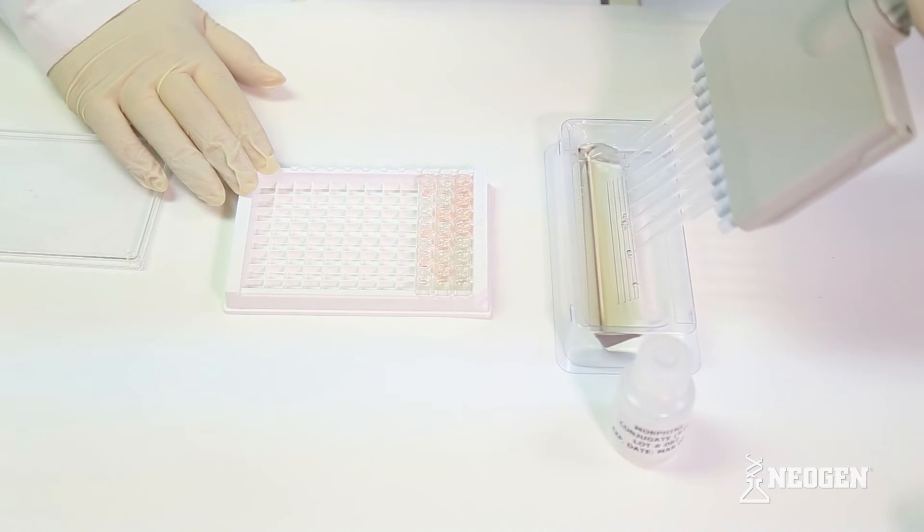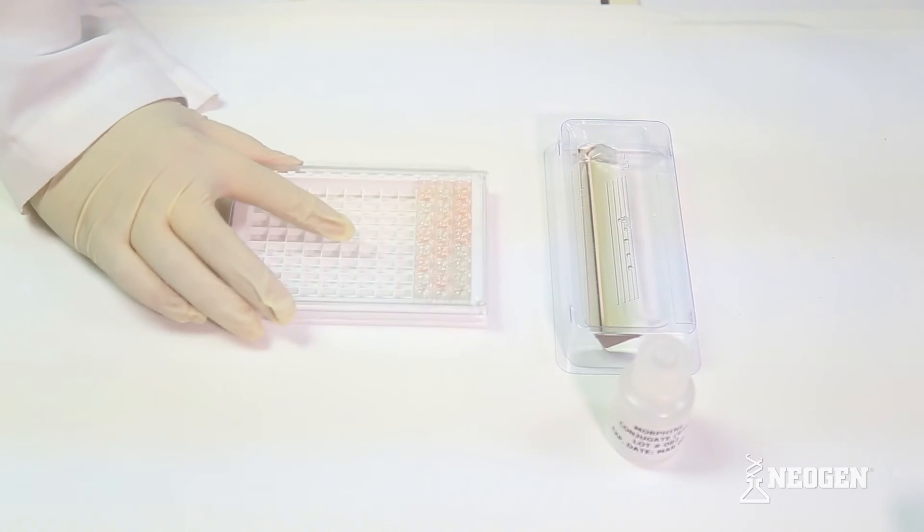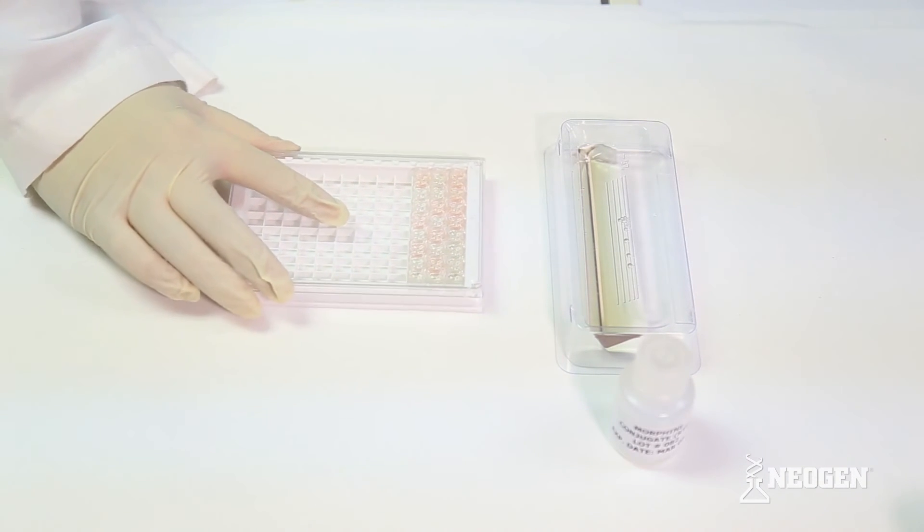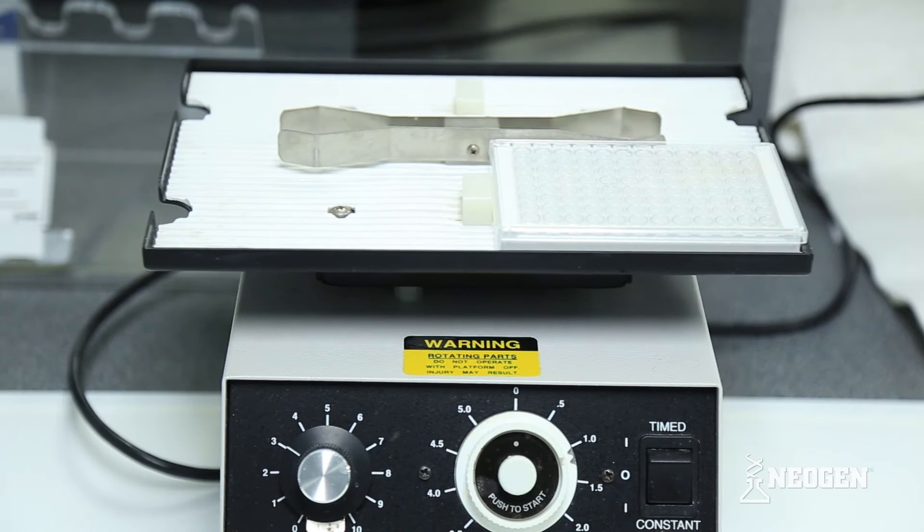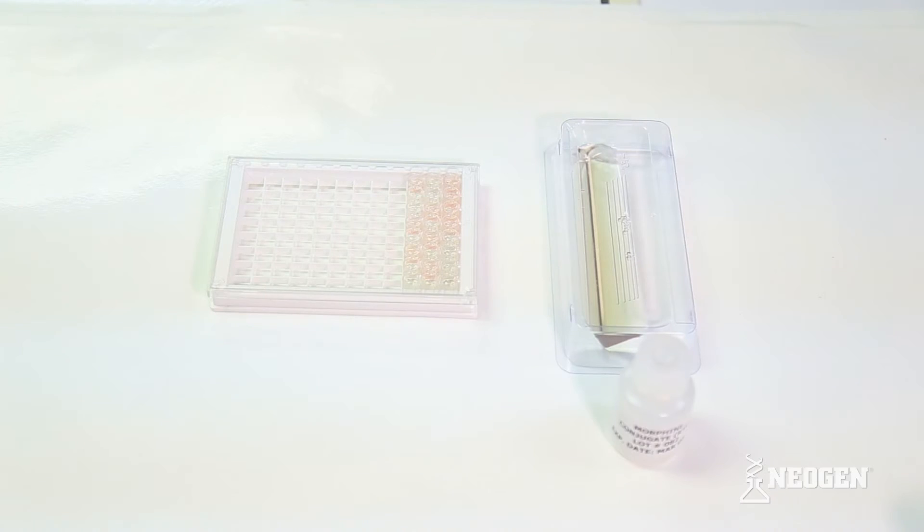Once the conjugate has been added to all wells, gently shake the plate for a minute or use a microplate shaker if one is available. Cover the plate and allow it to incubate at room temperature for 45 minutes.